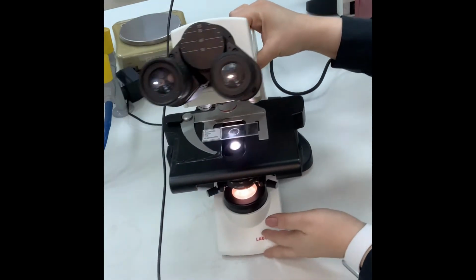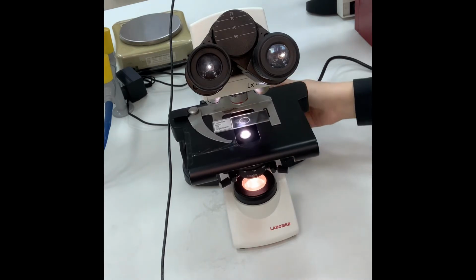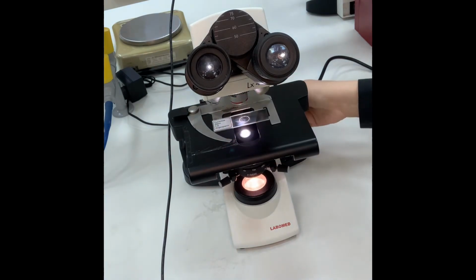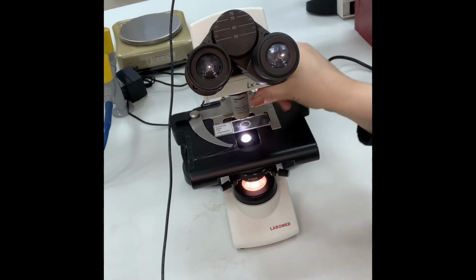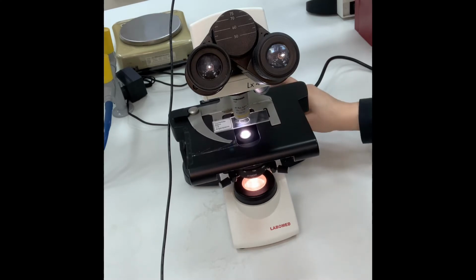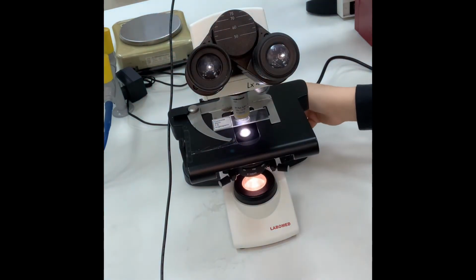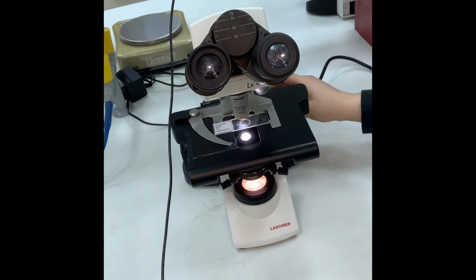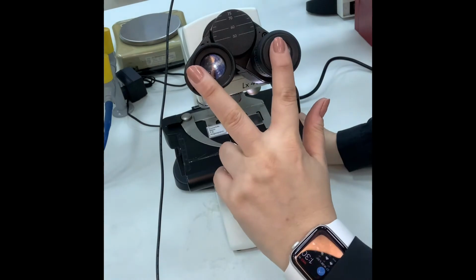Now, why do I choose the smallest objective over here? Because no matter how I keep pulling the coarse focusing stage, it won't touch the objective. I always start with a lower magnification, 4x, because if I use 10x while I'm pulling the stage with the coarse focusing knob, and I have to keep my eyes through the oculars to see the image, you need to be careful that you won't touch the slide and you won't break the slide, okay? So to be on the safe side, we use the lower magnification and your eyes through the oculars.